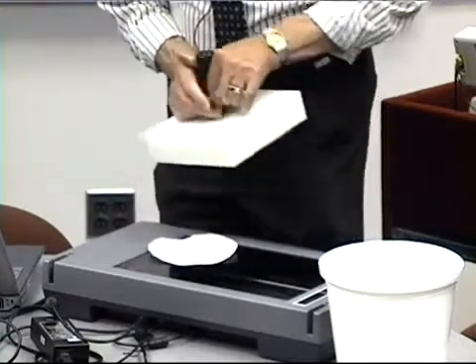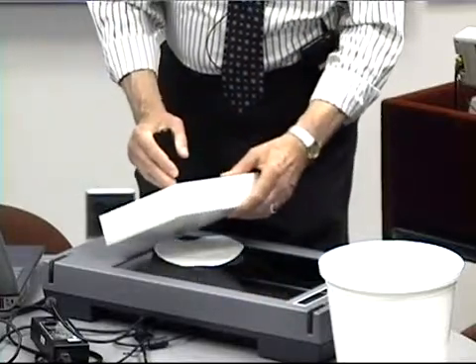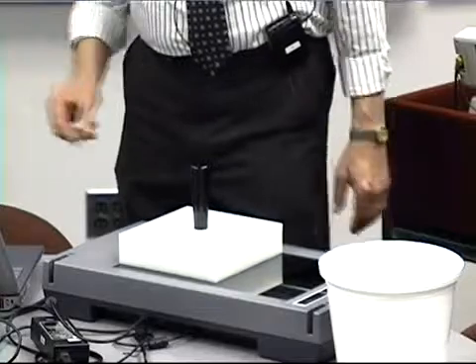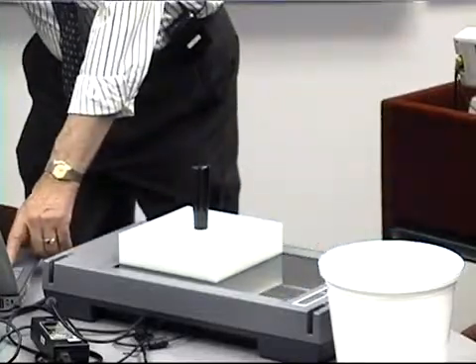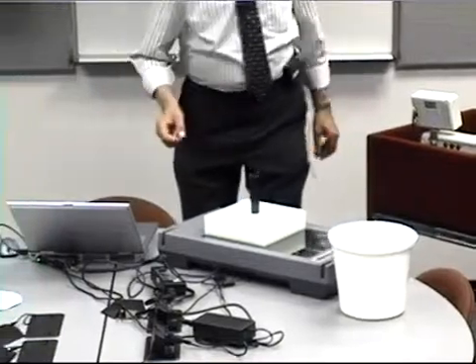We put it on the scanner and position it the same way each time. This makes it easy. And we put the block on and very simply place it. That is all that is involved with the measurement. We can then cause the scanner to measure, or to take an image of it, and away we go.